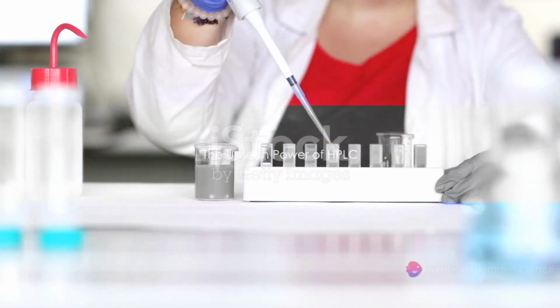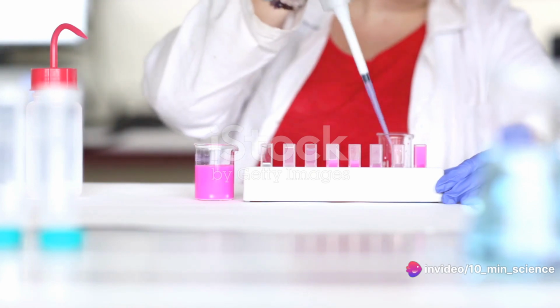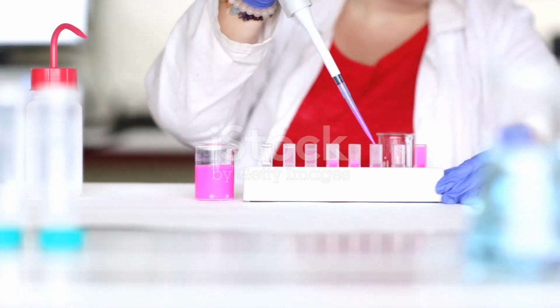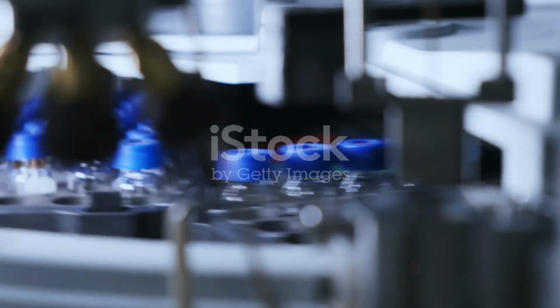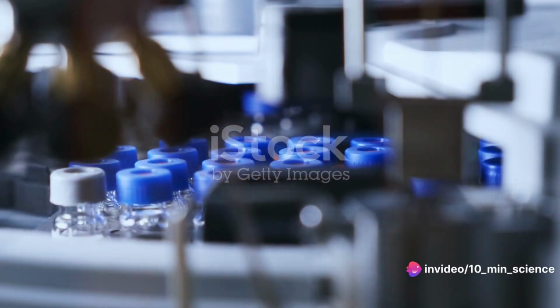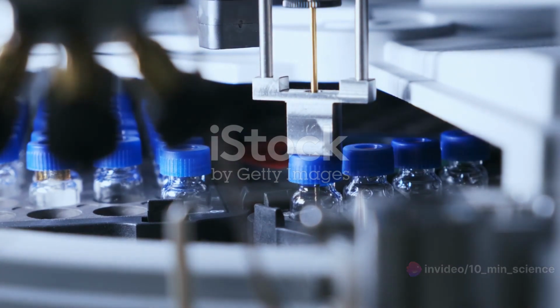Did you know that HPLC, or high-performance liquid chromatography, is capable of separating, identifying, and quantifying components in a mixture with such precision that it's used in everything from pharmaceuticals to forensics? Yes, you heard it right. HPLC is a powerful analytical technique that serves as the backbone of countless scientific endeavors. It's like a detective, probing into the heart of a mixture and revealing its most intimate secrets.